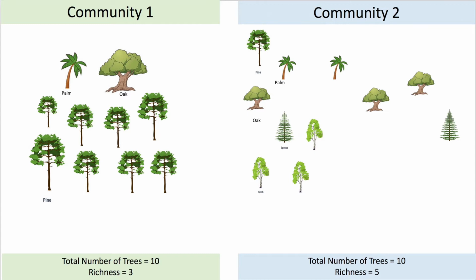And you'll notice that the willow trees, those are gone. And so now we only have 5 trees. Now, the willow trees, there were only 2 of those trees in our original community. And so typically, organisms that are found in very, very low numbers are more susceptible to being removed completely during a rarefaction process. And so that's why here now we see our richness went down.